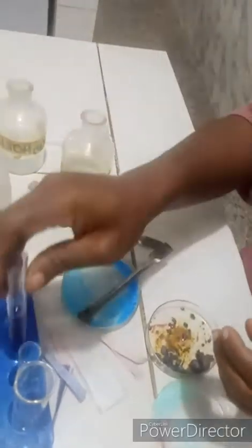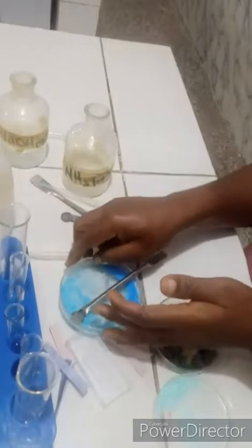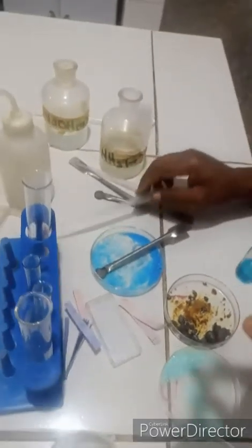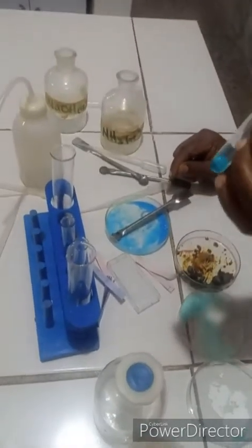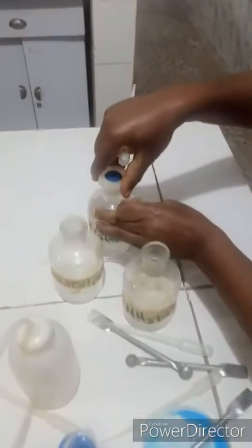So as you can see, we have established that the cation present in this given salt is copper 2 plus. Let's try to identify the anion present. As you know, every salt contains a cation and an anion for simple salts, except for double salts that have 2 cations and 1 anion. To the third portion of the solution, you add barium chloride. Like I told you, the method of identifying cations and anions, we use precipitating agents.